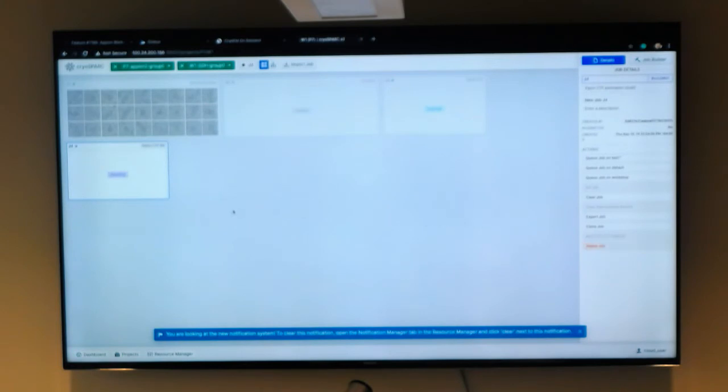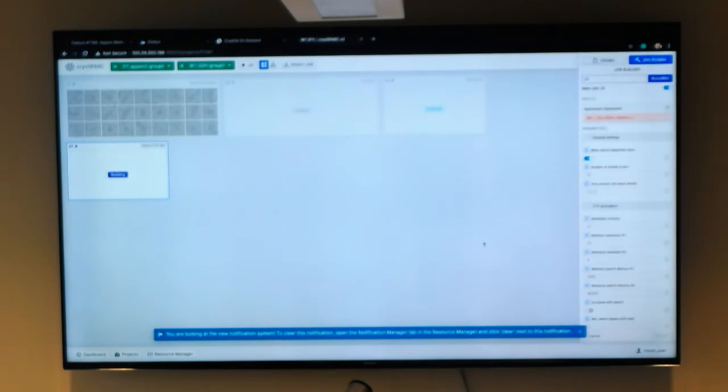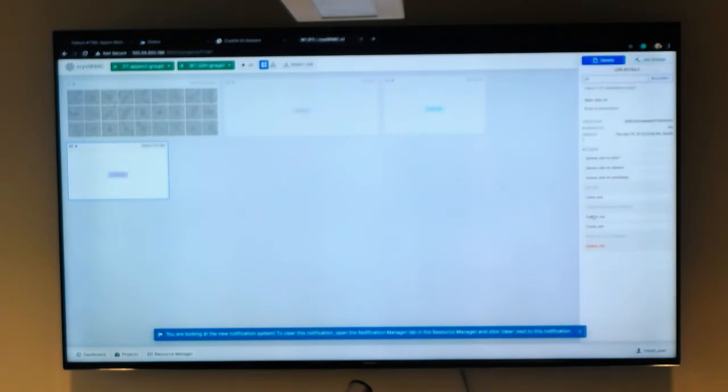Okay. There are certain things like, let's say you create a job, you can always curate it, delete it, add a description, annotate it. If you have a queued job and you don't want it, or it's running with a parameter you don't want, you can always kill the job, clear the job, and then go back into the builder and update a parameter.